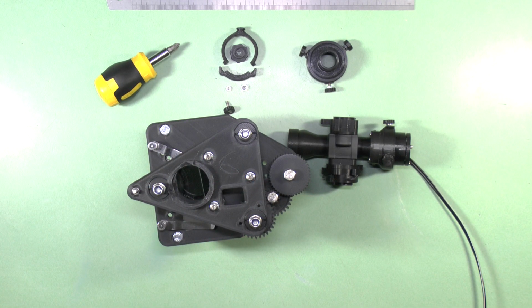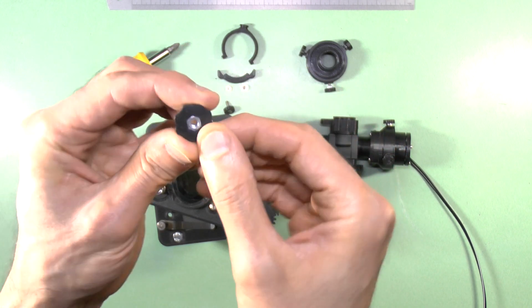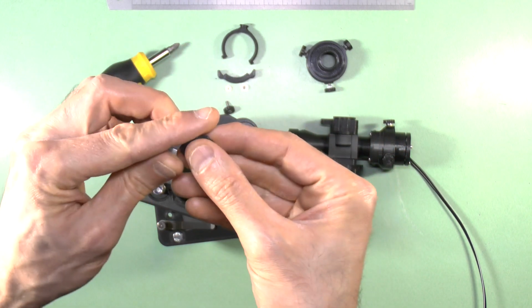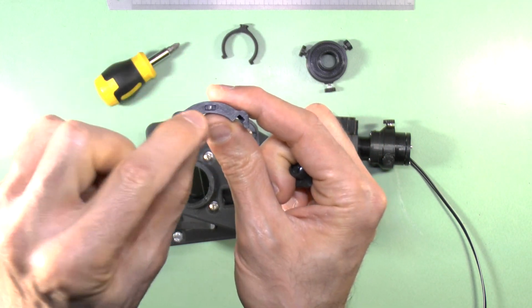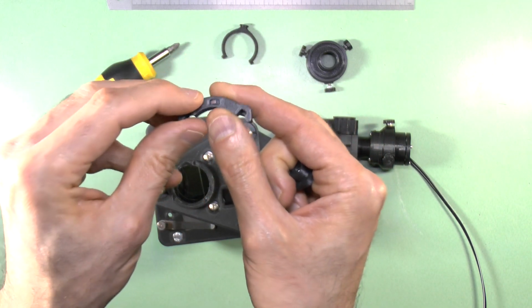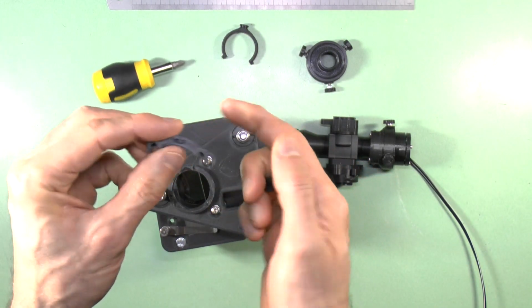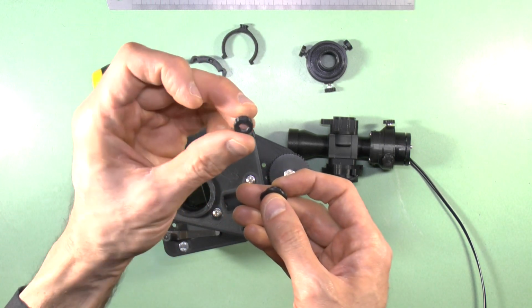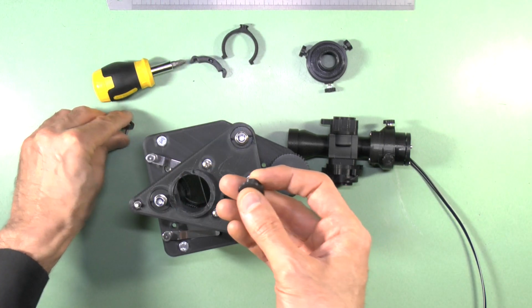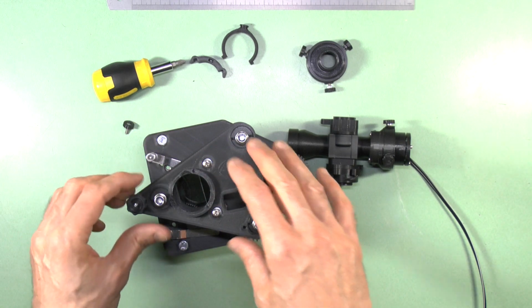Now prepare the stay thumb wheel by inserting an M4 nut into the recess for it. Prepare the clip lock module by inserting an M3 nut into this recess similar to the way you did for the illuminator adjustment rings. Make the M3 thumb screw as previously described for the illuminator adjustment thumb screws. Now thread the stay thumb wheel over the M4 screw in the focus plate.